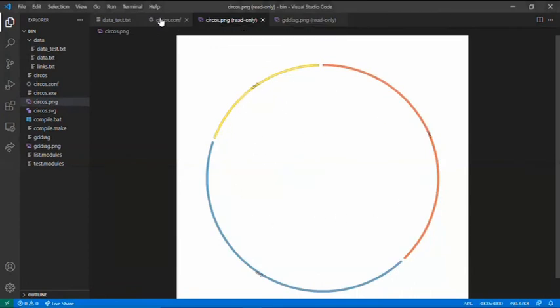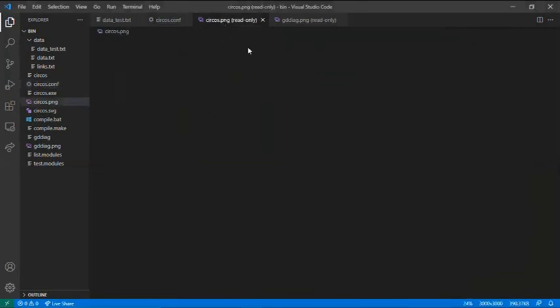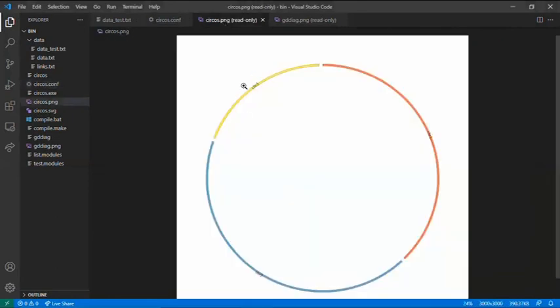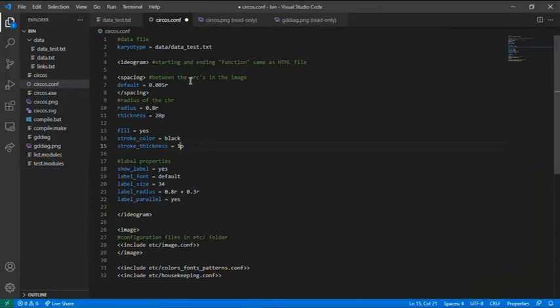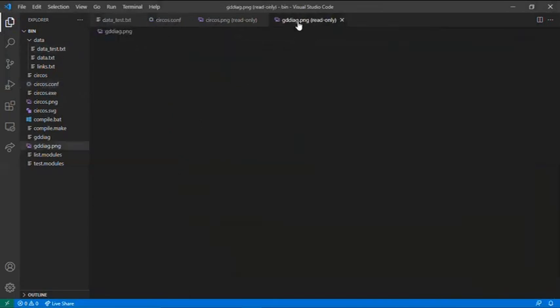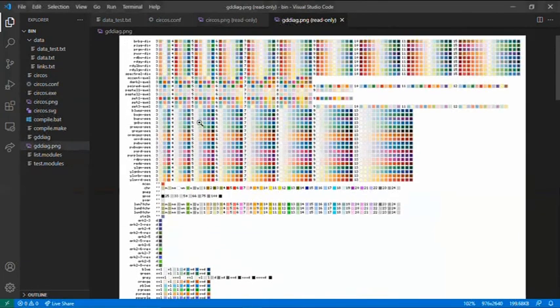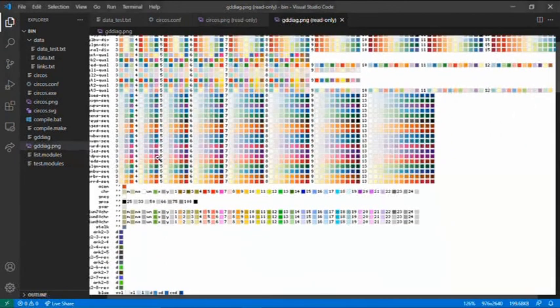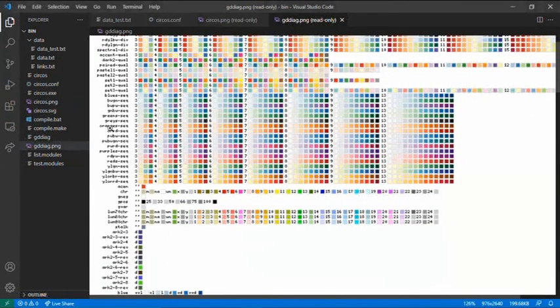Another test we can use. As you can see, my label is inside the image. So I need to put it a bit bigger. And I will plot this thickness a bit bigger as well. And I will change one of the colors. Imagine you want to use these gradients of colors. Imagine I want to use the orange sequence.